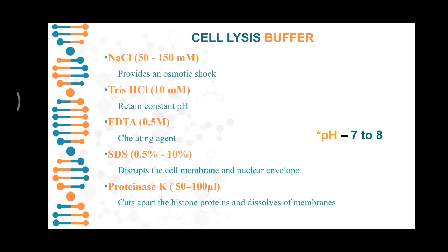In cell lysis, we'll be using cell lysis buffer. These are all the major components which are there in cell lysis buffer. We'll see a simplest definition and use of each component, that is each chemical.